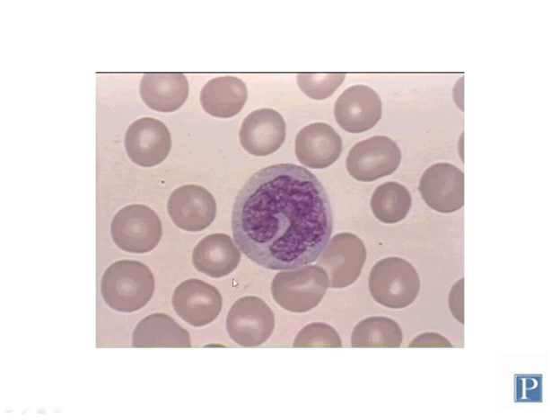Here's another blood smear showing the other type of agranulocyte. These are the third most common cells, so they're easier to find than eosinophils and basophils, but harder to find than lymphocytes and neutrophils. This cell is called a monocyte. They are most commonly confused with lymphocytes because, like lymphocytes, they don't have granules in the cytoplasm and they have a very large basophilic nucleus. However, monocytes are the largest cell types, so they're bigger even typically than the largest of the lymphocytes, and so you can see this monocyte is several times larger than these neighboring red blood cells.